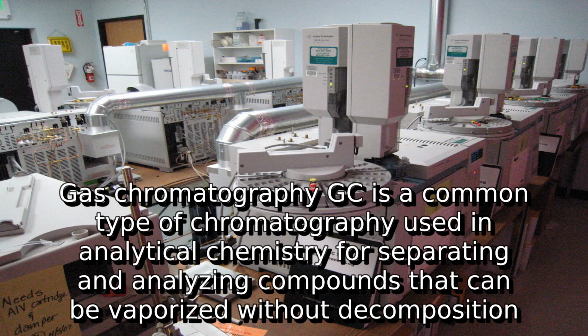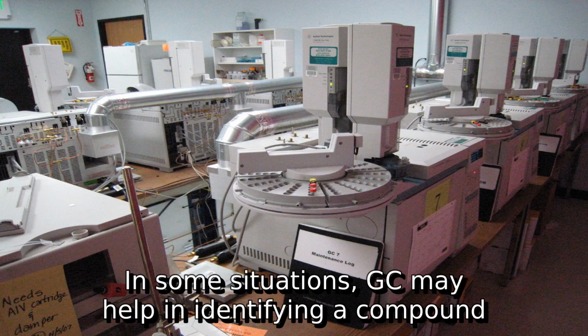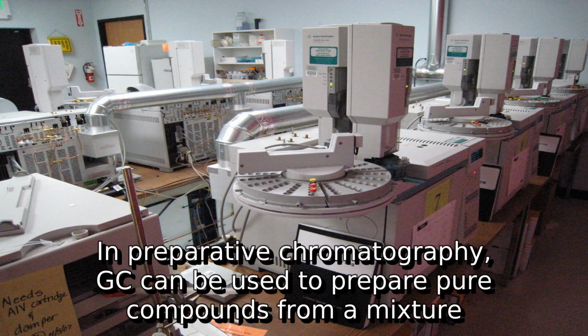Gas chromatography (GC) is a common type of chromatography used in analytical chemistry for separating and analyzing compounds that can be vaporized without decomposition. Typical uses of GC include testing the purity of a particular substance, or separating the different components of a mixture. The relative amounts of such components can also be determined. In some situations, GC may help in identifying a compound. In preparative chromatography, GC can be used to prepare pure compounds from a mixture.